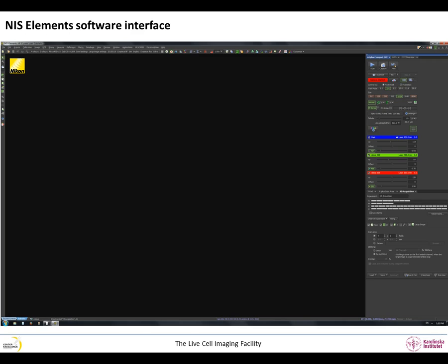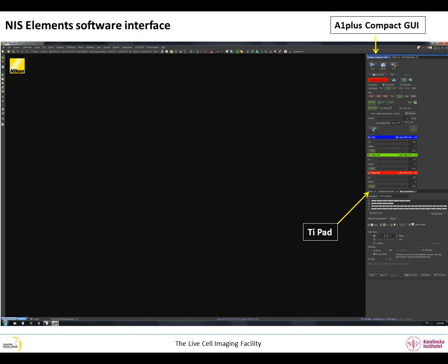Now I will present the functionalities of some of the tabs in the basic layout. The TI Pad tab, some features between the A1 Plus Compact GUI tab and the A1 Plus Scan Area tab.